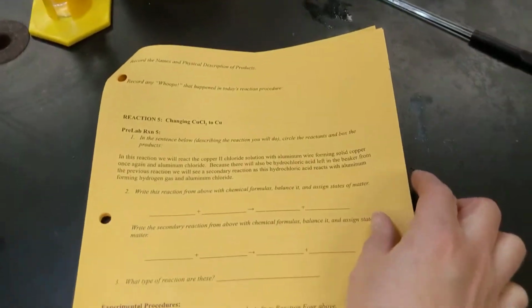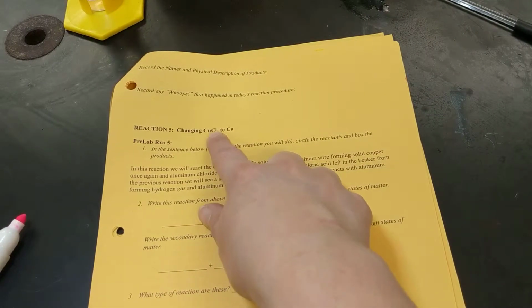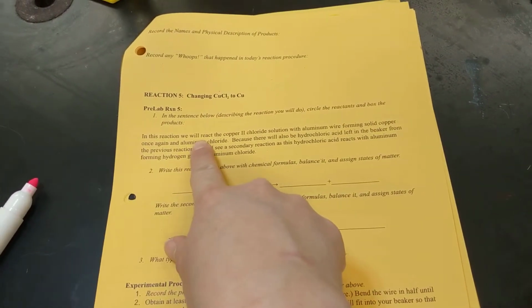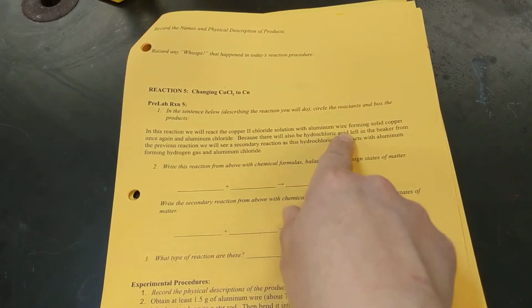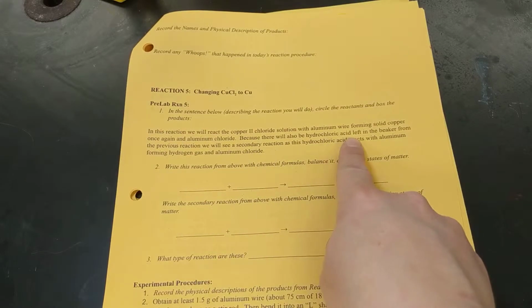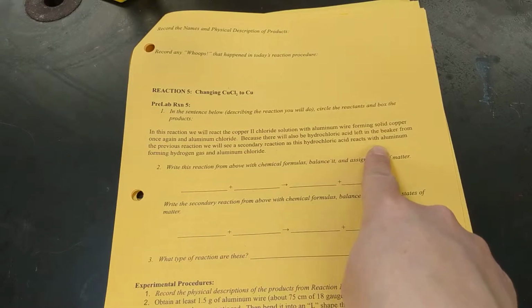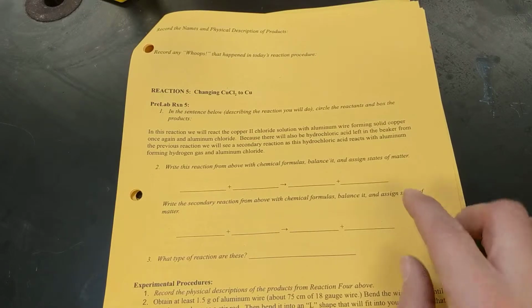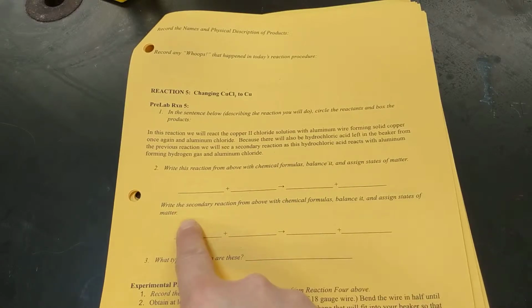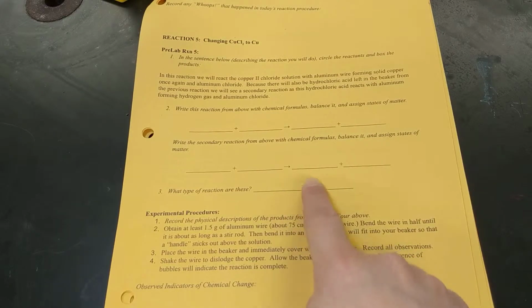And then reaction 5, we're going to take our copper 2 chloride, which is dissolved in solution, so it's going to be aqueous again, and we're going to get it back to copper. So if we read, it says, in the reaction, we will react the copper 2 chloride solution with aluminum wire, forming solid copper, once again, and aluminum chloride. Because there will also be hydrochloric acid left in the beaker from the previous reaction, you will see a secondary reaction as the hydrochloric acid reacts with aluminum, forming hydrogen gas and aluminum chloride. So we're going to write 2 reactions, the primary reaction happening with the copper, and then a secondary reaction as talked about up here. Both of them are similar types of reactions, so you'll write that.